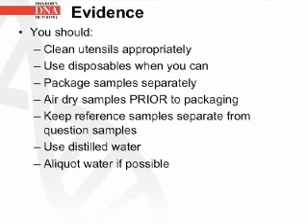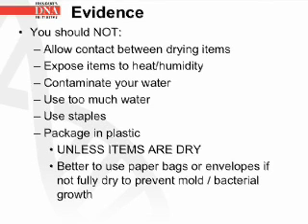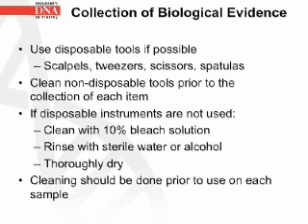Things to avoid when handling evidence: you should not allow contact between drying items, do not expose items to heat or humidity, do not contaminate your water or use too much water, do not use staples, and do not package in plastic unless the items are dry. It is better to use paper bags or envelopes if not fully dry to prevent mold and bacterial growth.